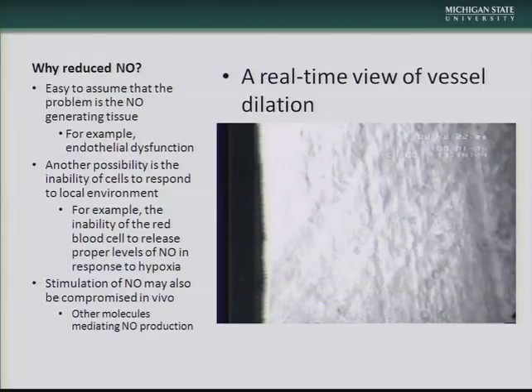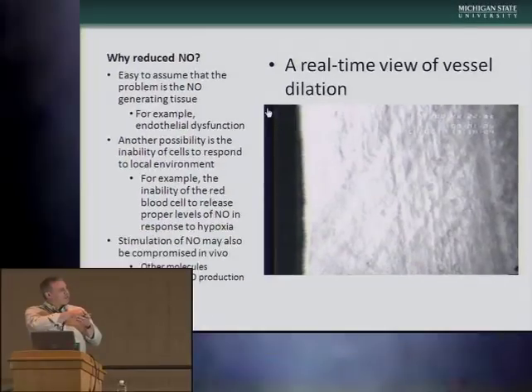For those of you who have seen me speak before, you're probably sick of seeing this little movie, but I knew there'd be students here that maybe haven't seen this particular clip. I got this film clip about 10 years ago from Mary Ellsworth, who's in the Department of Pharmacological and Physiological Sciences at St. Louis University. This is actually tissue from a hamster cheek retractor muscle.